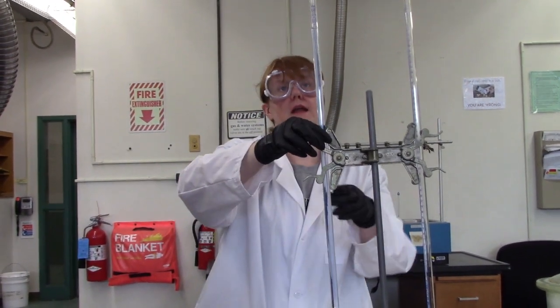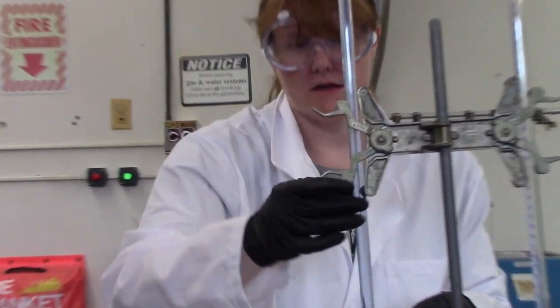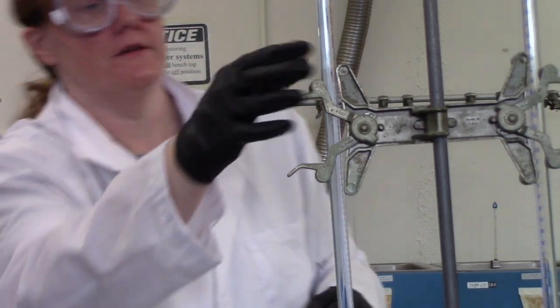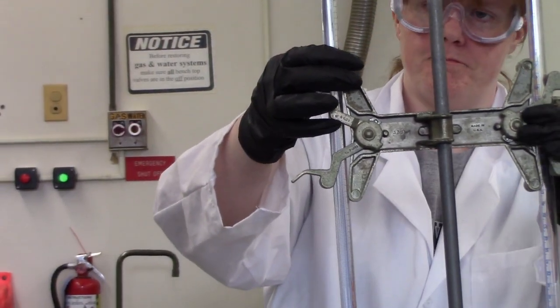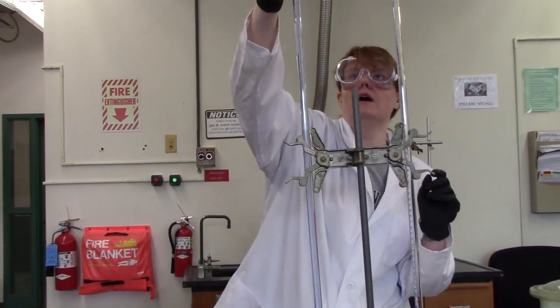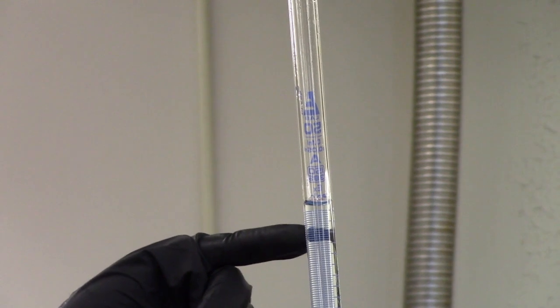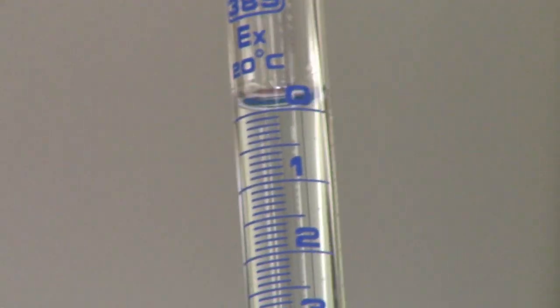Okay, so when I put the buret in here, I'm going to make sure that the clamp is holding it completely vertically. I don't want it tilted one way or the other, because that's going to affect where the bubble is. I take out my funnel, because if you look at this closely, when I did that, some more stuff dripped down. So it was the perfect volume, but if we can zoom in a little bit, we'll see that it is not at zero anymore. Let me turn it around so you guys can read it. All right, so our zero mark is right there.